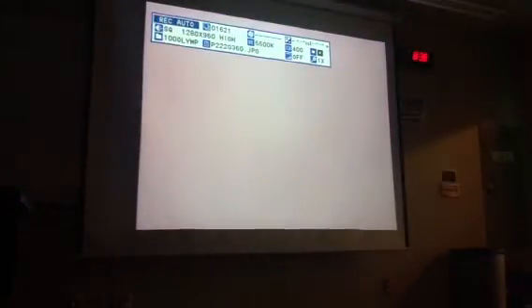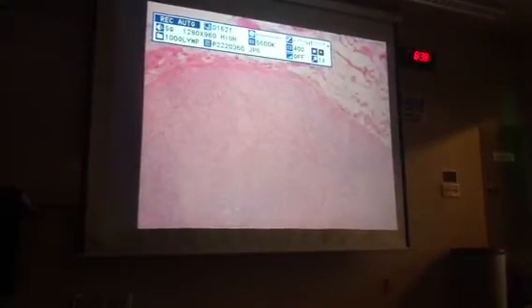Okay. So then if we go over to the adrenal gland, I generally think the adrenal gland is one of the harder slides.